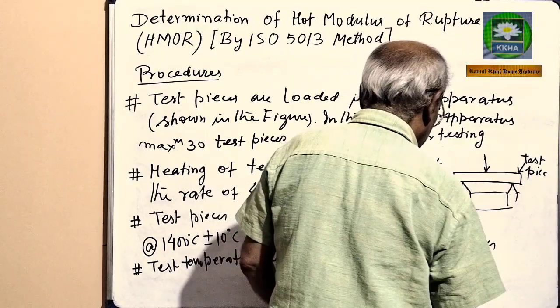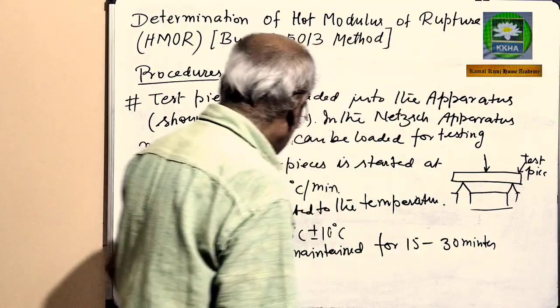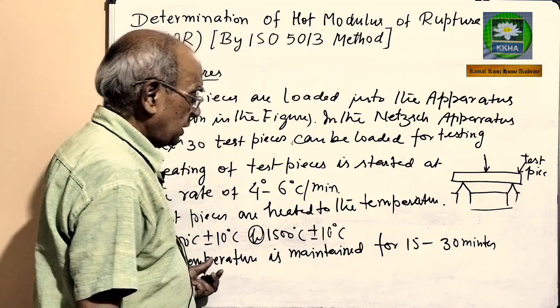Actually, the soaking time depends on the type of samples.